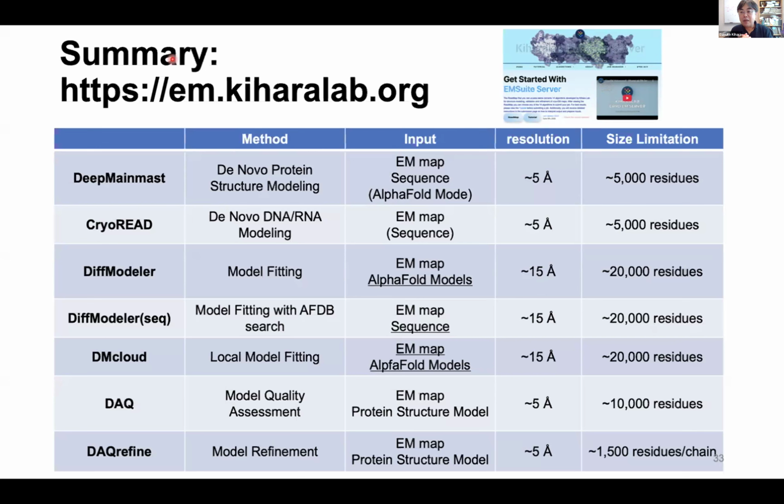Or sometimes authors do not model all of the ligands, especially if they are general ligands like NAG or small sugar molecules all over the place. That makes our work difficult because I don't have a ground truth.